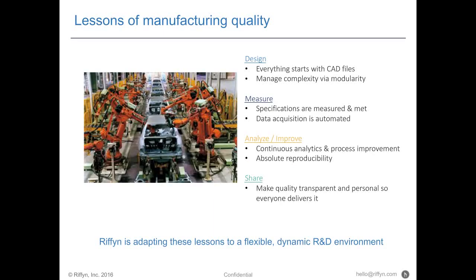They start with design, the idea that if you want to have a trustworthy result, you have to be very explicit about how you are going to deliver that result. What is the process or technology or method you're going to use to achieve that outcome. Then you measure whether you're actually delivering on the design specification and analyze that data to look for deviations from expectation and ways to improve it.